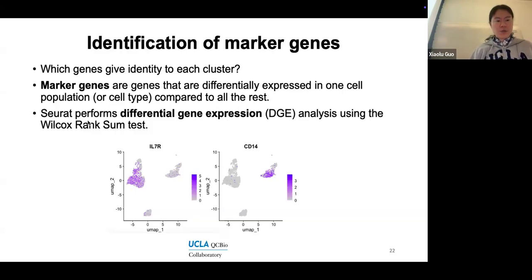And Seurat performs the differential gene expression analysis using the Wilcoxon rank sum test.